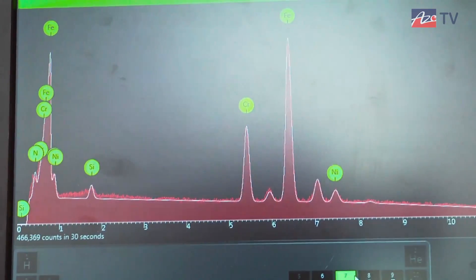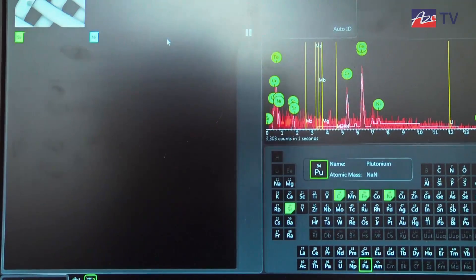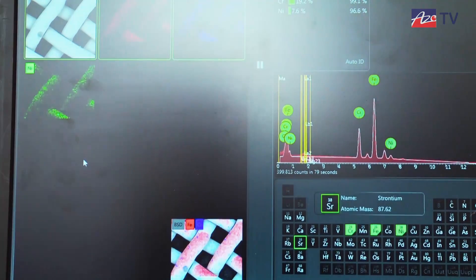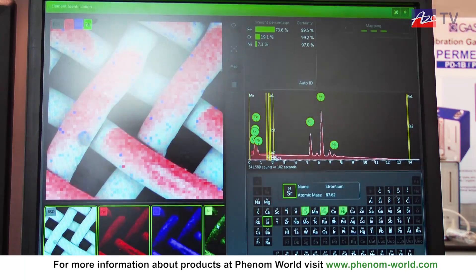We'll create a map of this specimen. Over here you can see an iron, a chromium, and a nickel map occurring. And that's basically all there is to a Phenom: you insert the specimen, you look at it, you do a chemical analysis with hardly any knobs, and there are your results. That's all there is to it.